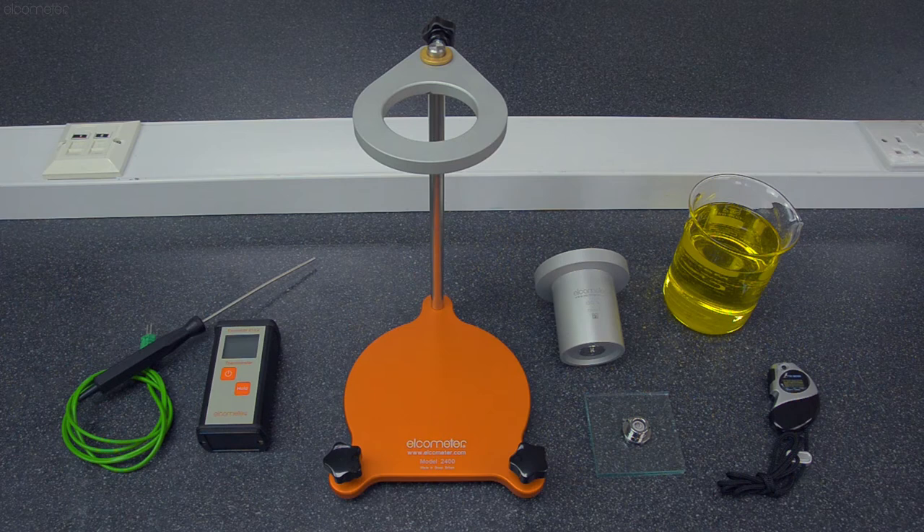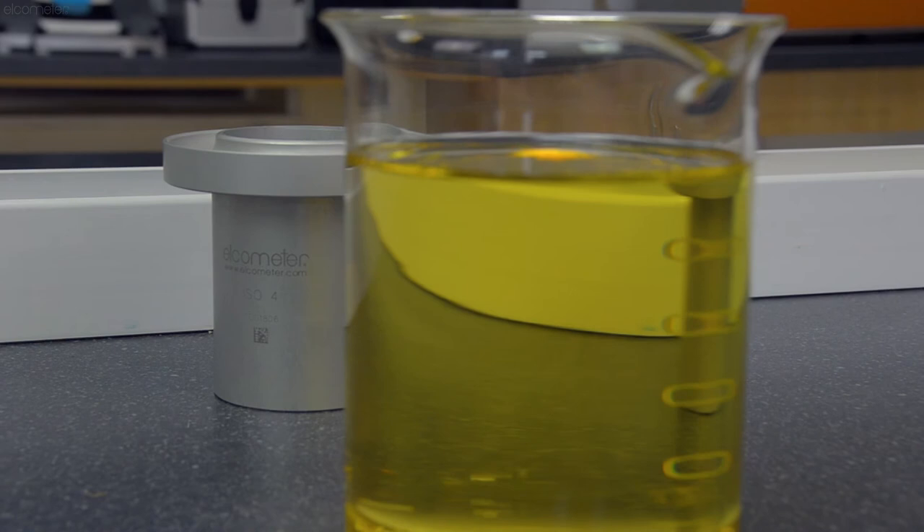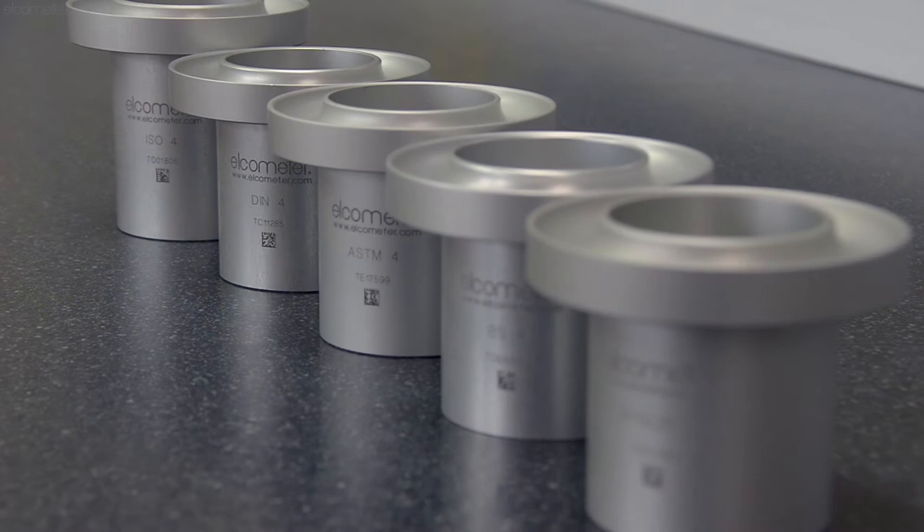To test, you'll need a flow cup, a flow cup stand, a glass plate and bubble level, a stopwatch, a thermometer with a liquid probe, and a container of your sample liquid, ensuring there's enough of a sample to more than fill the flow cup.